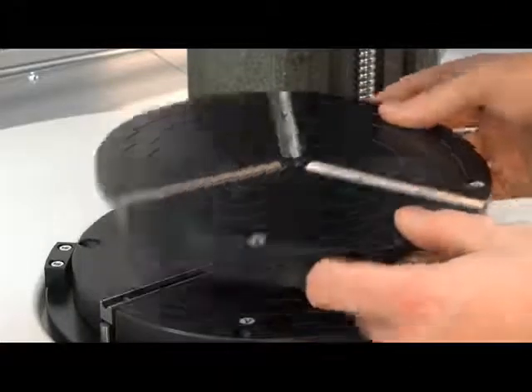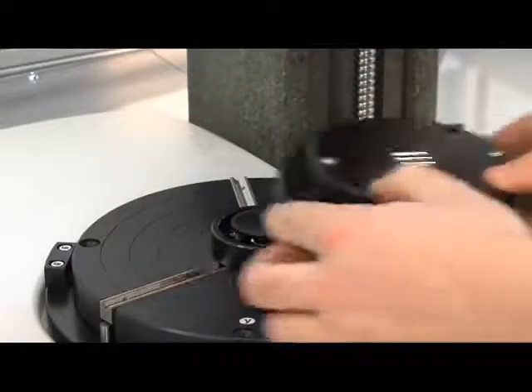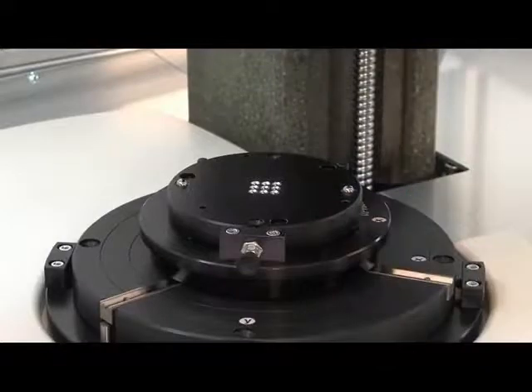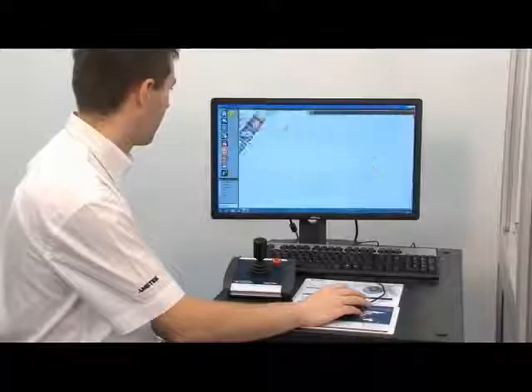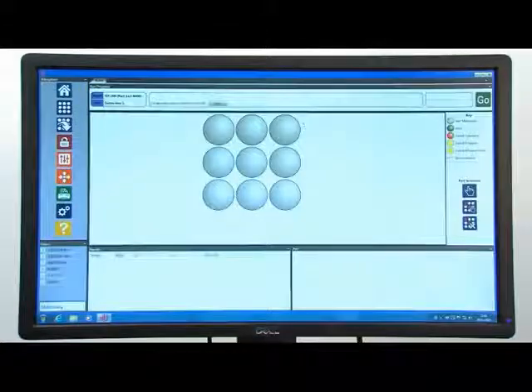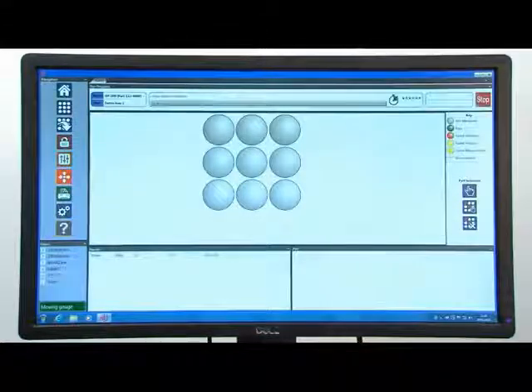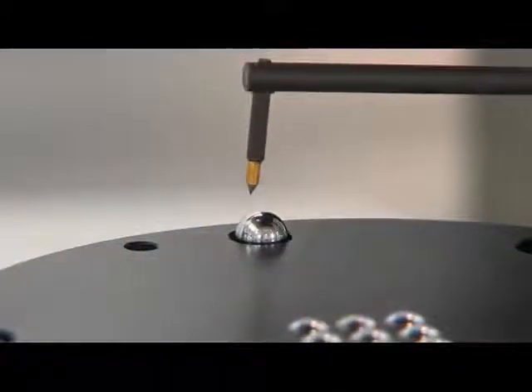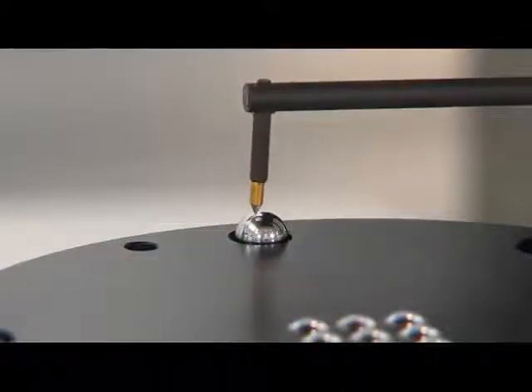Part setup is quick and easy. To start the batch measurement, select the batch template and hit go. The PGI Matrix first performs cresting alignment checks.